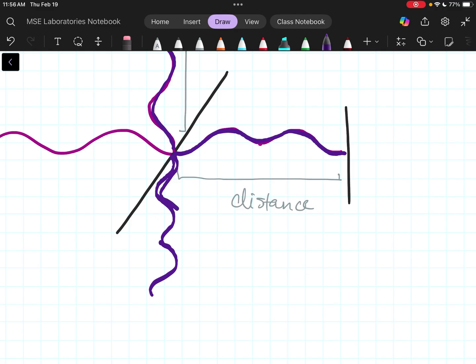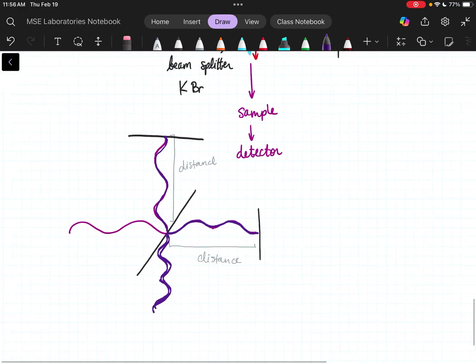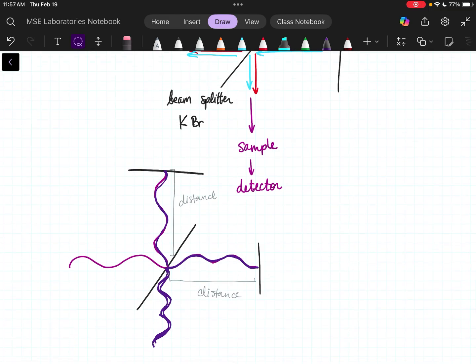Meaning now on the backwards path, they're both starting on low. And we end up with the exact same wave, two of them sitting right on top of each other. Really hard to draw because this is all time related, and my picture is just static. I can't just show time. So as long as the distance between these two is the same, I'm going to end up with the exact same pattern back.